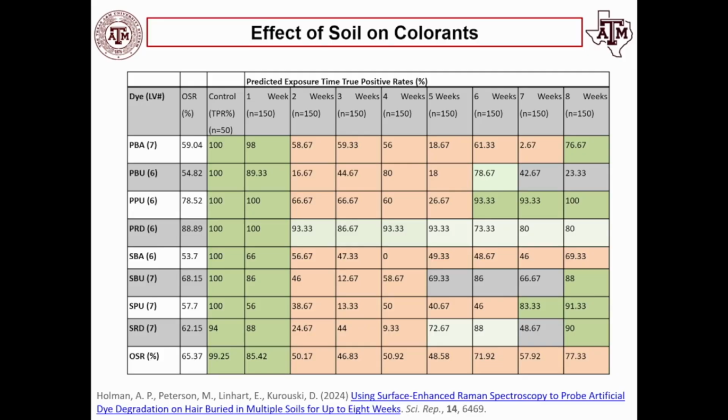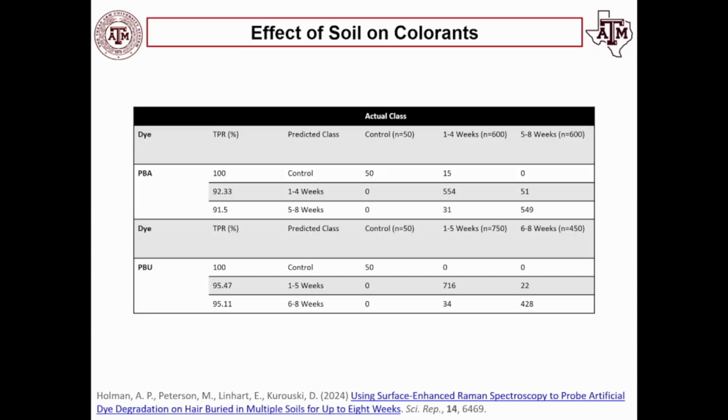So as you can see here, we found a case in which SERS is not great, but it's also very important for forensic investigators to know that if hair spends more than 1 week in soil, then SERS-based analysis of colorants present on hair may not be as robust and reliable as expected.